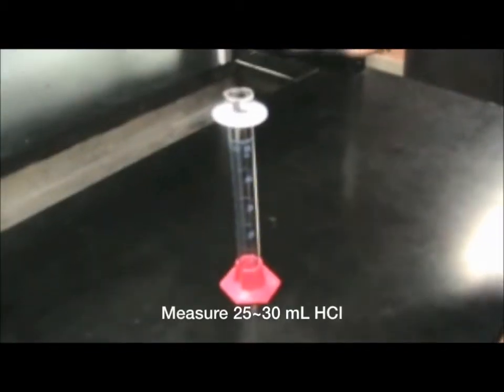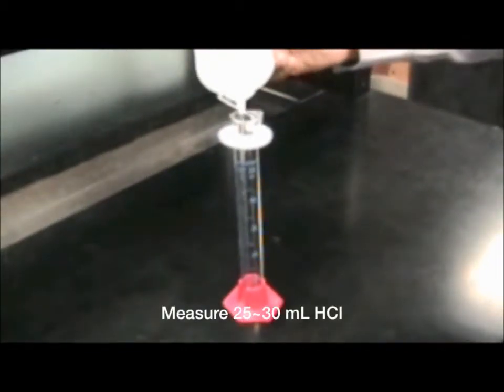Next, you need to measure about 25 to 30 milliliters of 1 molar HCl into a graduated cylinder and record the volume.